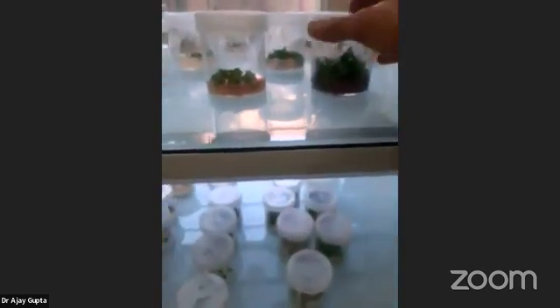So one plant is multiplying 20 times. If you have 1,000 plants, they become 20,000 plants within a 3 month span, around 12 weeks. After this process, they are transferred to the growth room.